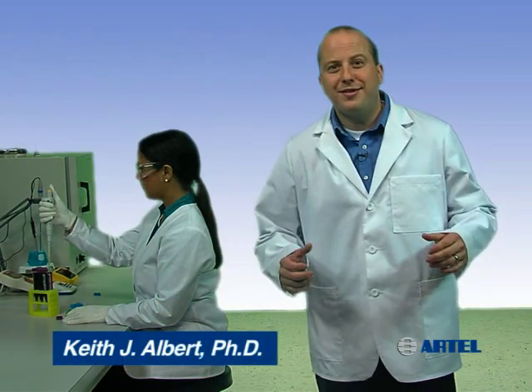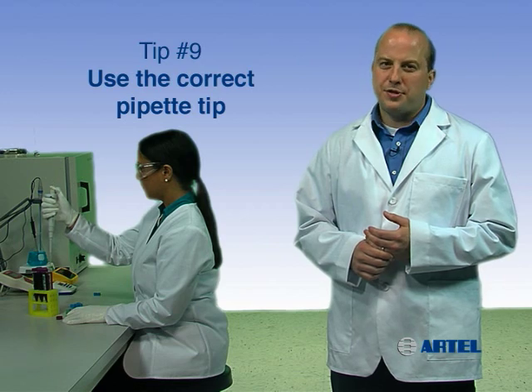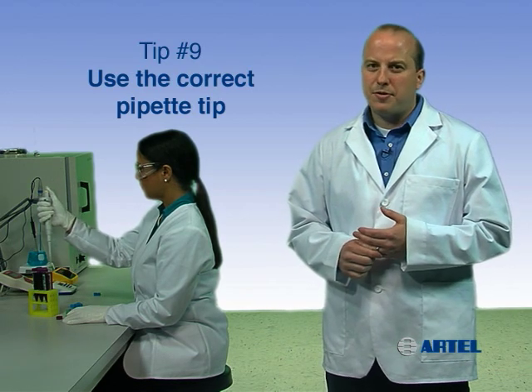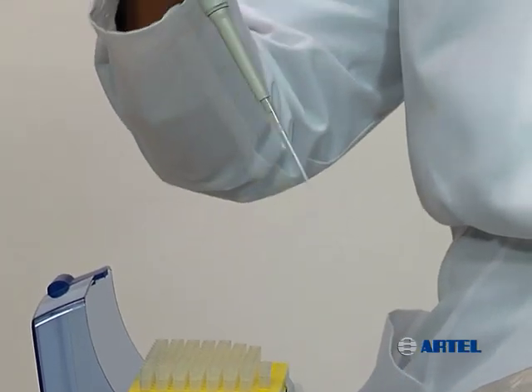By using proper pipetting technique, you can help ensure liquid handling quality in your lab. Pipetting tip number nine is: use the correct pipet tip. For the pipet being used, it's very important to choose the correct tip. In most cases, manufacturer tips are preferred and provide the best seal for more dependable sample delivery.